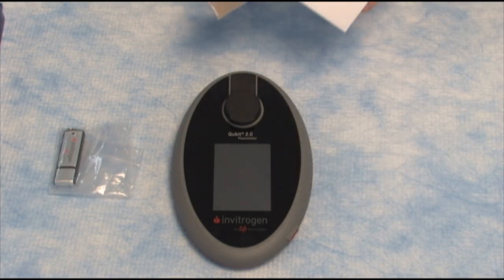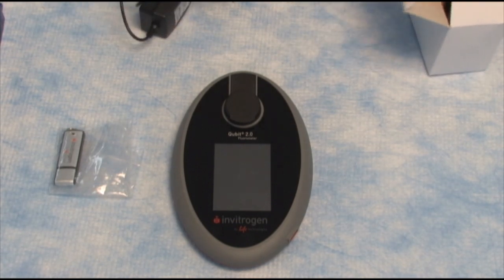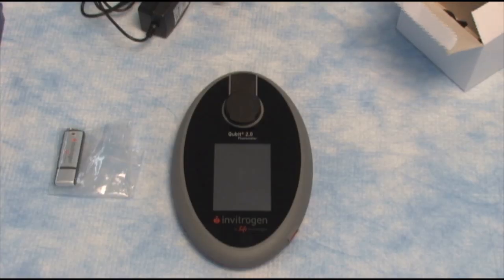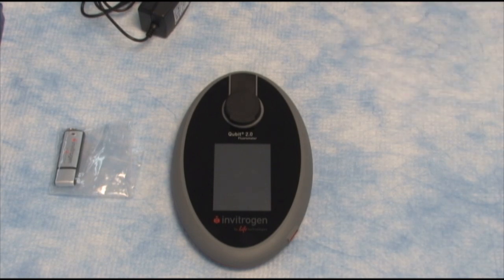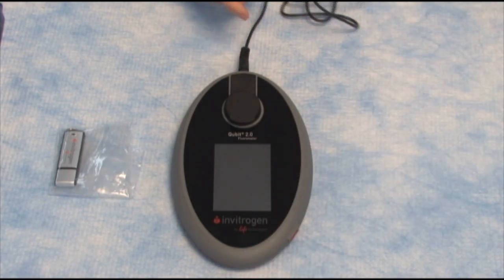What you'll find in the power supply box is your power supply with a bunch of different plugs. This is very nice if you ever move countries — you'll be able to use the Qubit and take it with you. We'll use the US plug today and just very easily pop it on here. Ready to go.